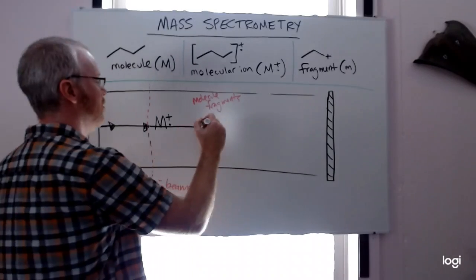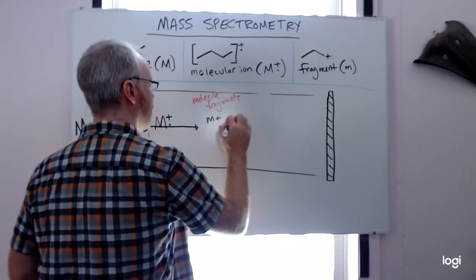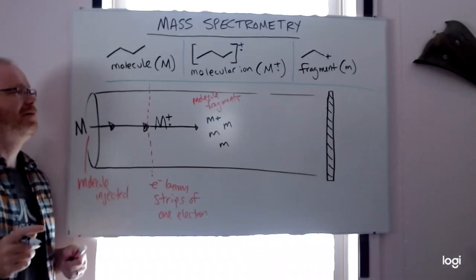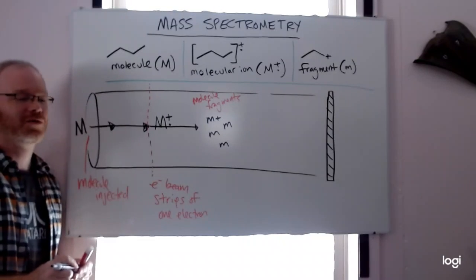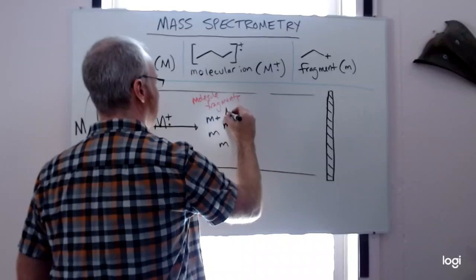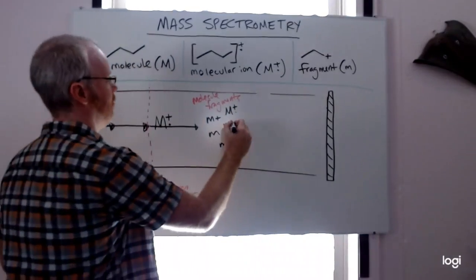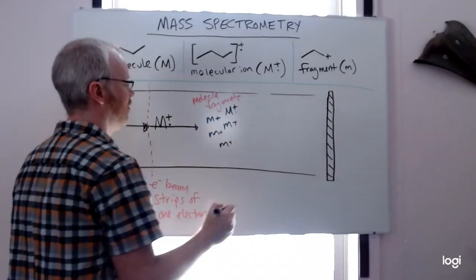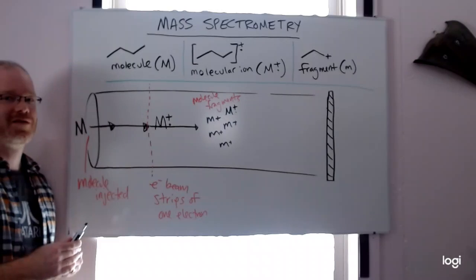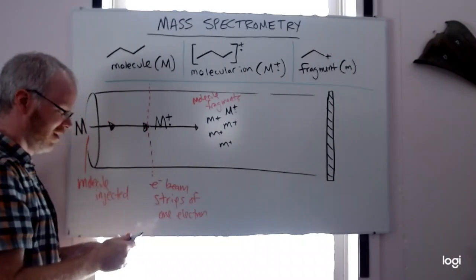So in this case, you can get a variety of fragments. But not every single molecule will fragment. In a lot of cases, the complete molecule will also survive here as well. So our fragments with charge, and we can talk more about fragments and fragmentation and reading spectrum in another video. This is kind of the basics.